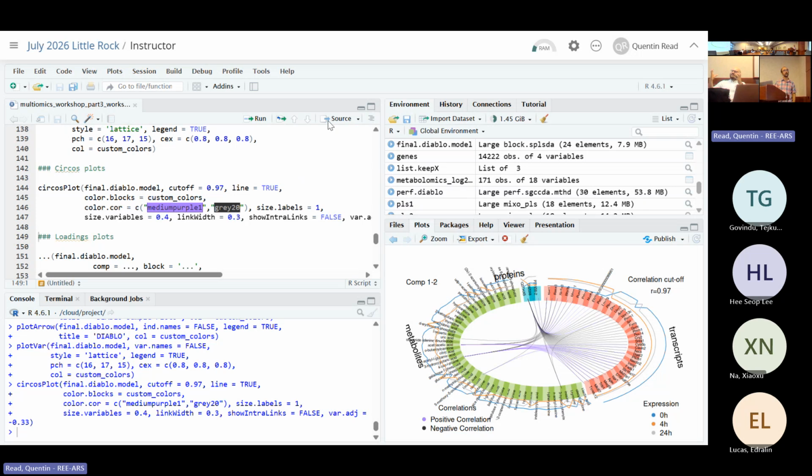Yeah, it scrunches it down, and these will all end up on your plot loadings anyway, because these are the selected features. So if you're interested in making the plots cleaner, plotting it yourself is the way to get around it, unfortunately. And you may have a much smaller number of features as well, depending on how your model shakes out. If there are only like 10 around this whole circle, then it wouldn't be a problem to show all of them. But this one ended up with about 100, so there's quite a lot going on.